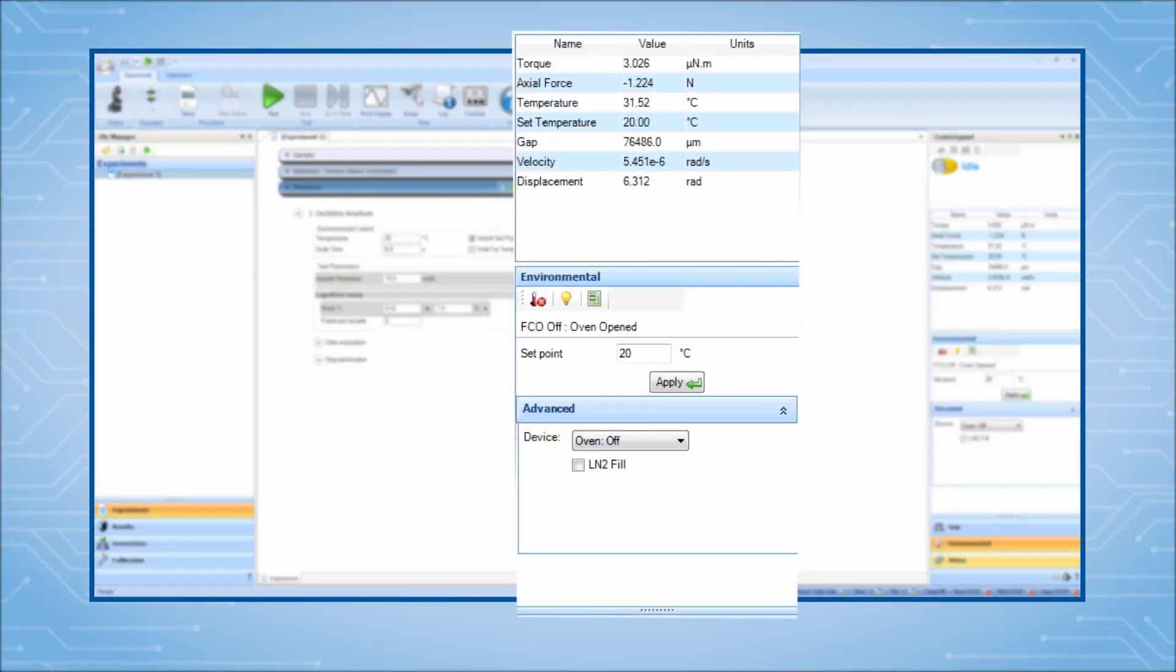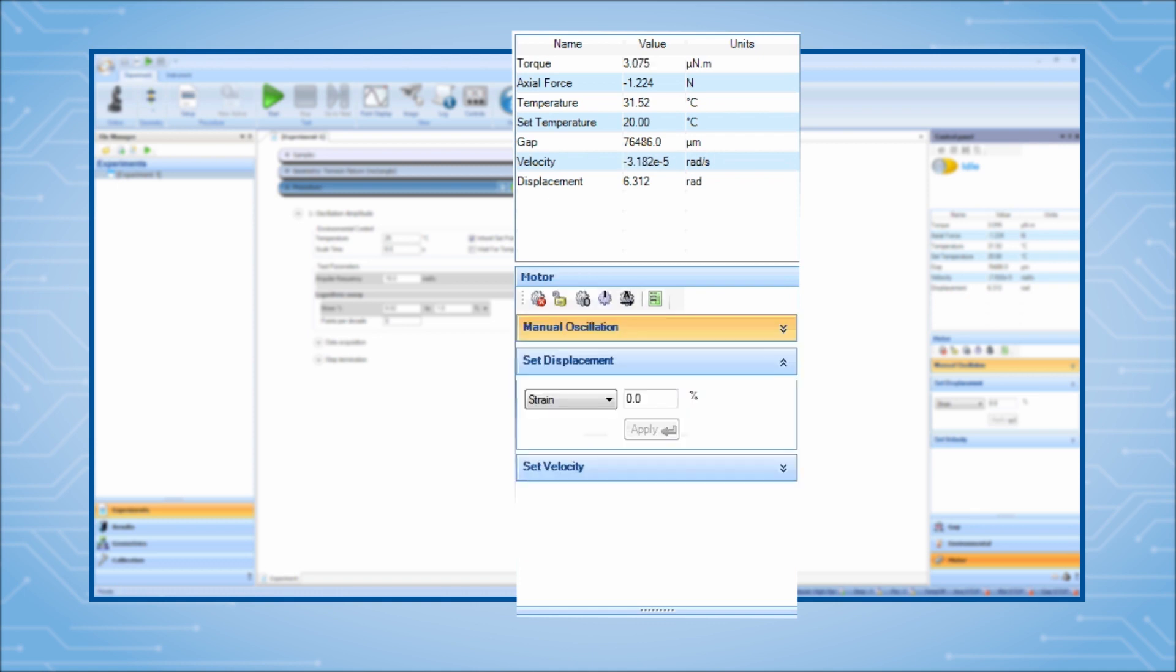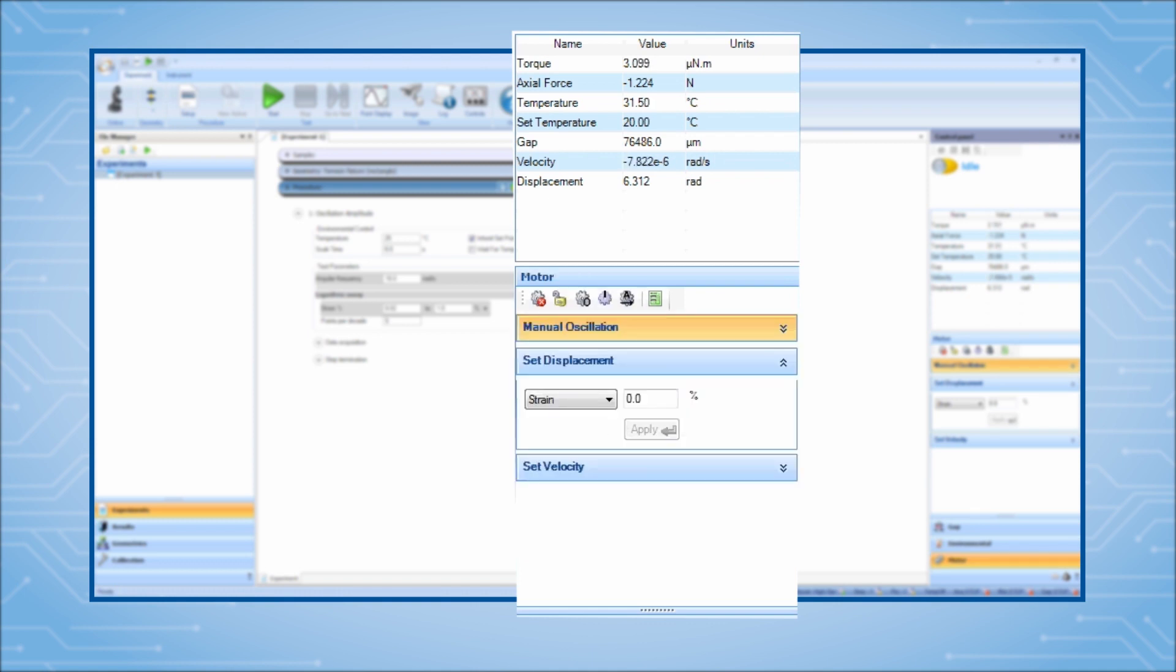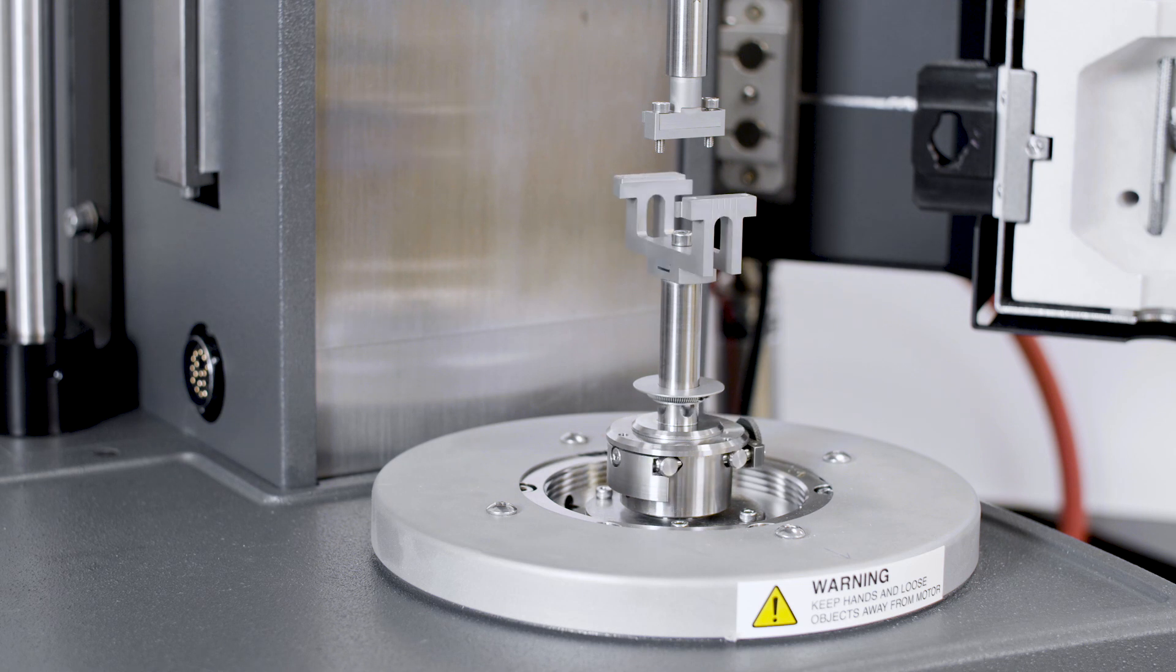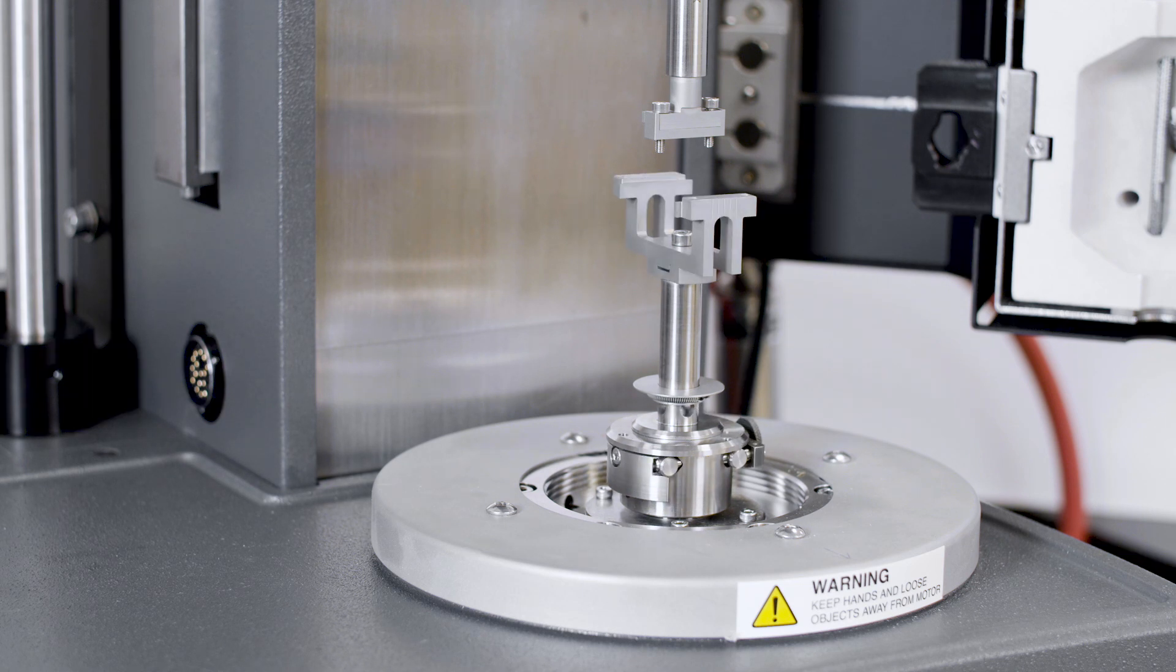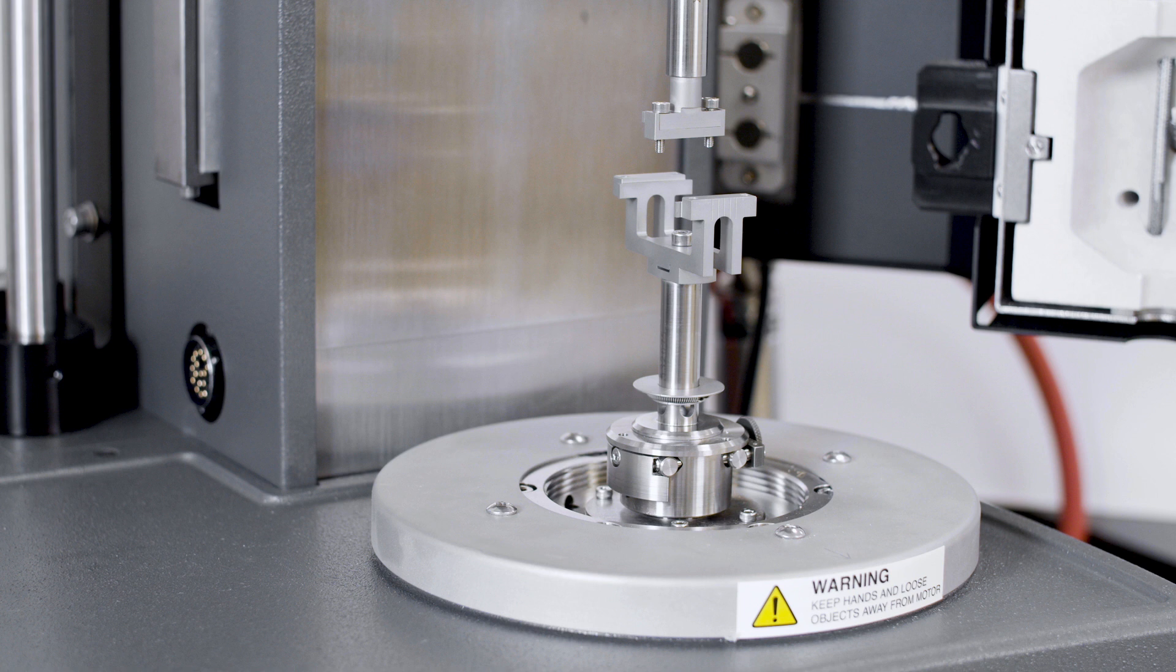You can now use the Move to Alignment Position button on the Motor Control Panel at any time to return the geometry to the alignment position. This guarantees the geometries are always aligned with one another during testing.